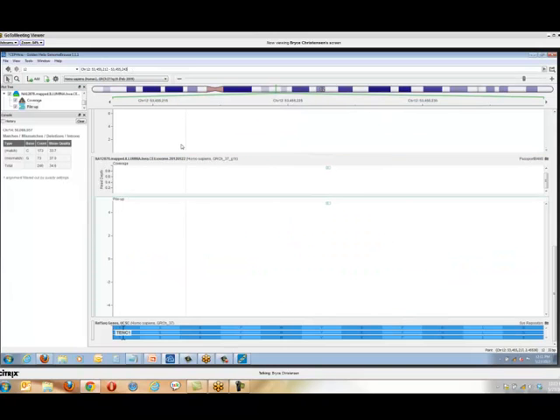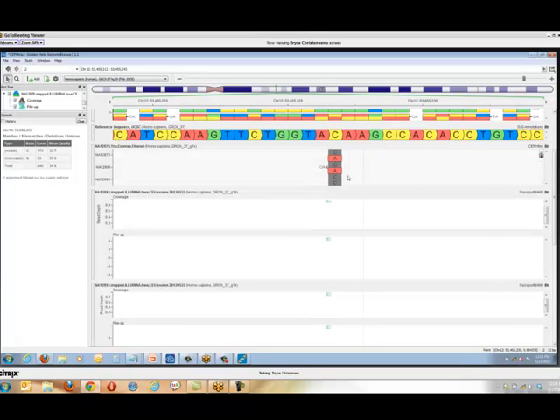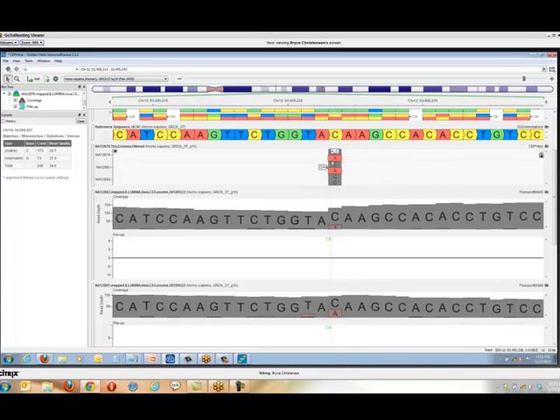And we looked a minute ago at a de novo that looked like it was probably real. Now this one, though, if we give it a moment to come up, this is my external drive taking its time, we can see that, well, actually, I see what's going on. It was called two different ways.